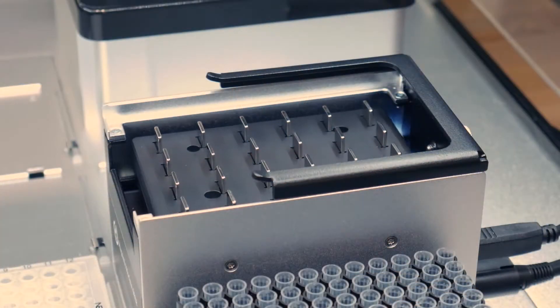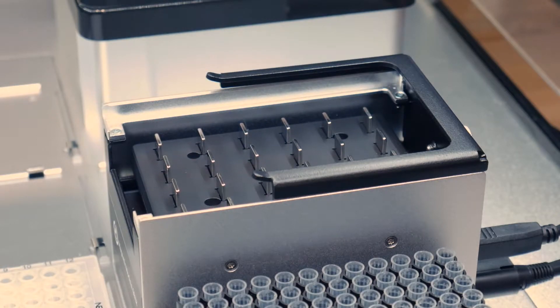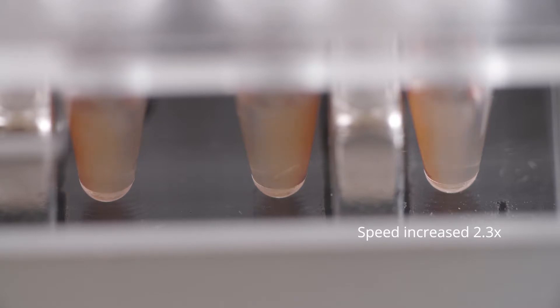The next add-on is our magnetic module. It allows you to perform purifications and extractions using magnetic beads. The magnetic module automatically raises and lowers magnets to the plate that sits on top of it. This allows you to pull down whatever beads you're using and extract the molecule you're looking for. Many of our customers use this for nucleic acid purification and extraction.